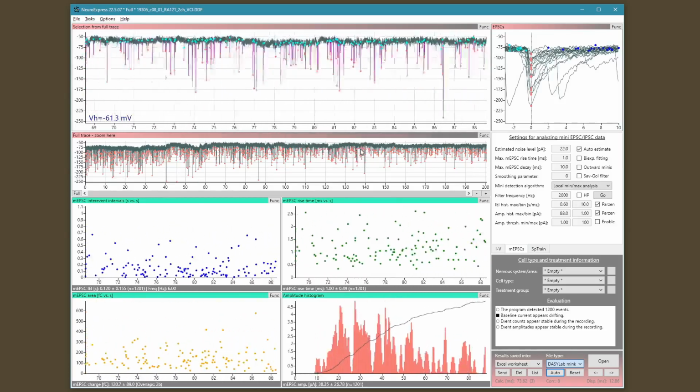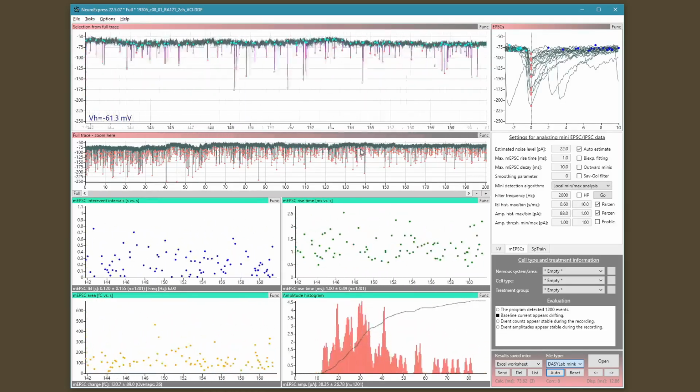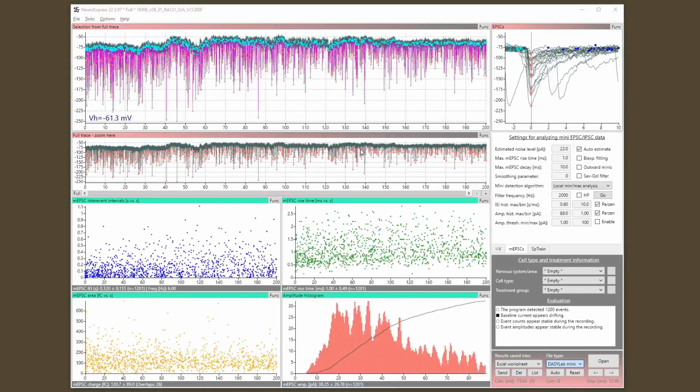Basically the program will run through the entire experiment, and it will create frames, and these frames will be used to create the GIF animation. So this is like an animated GIF that can be used in a PowerPoint presentation, and it can be a really nice and interesting way to demonstrate your data and your findings.